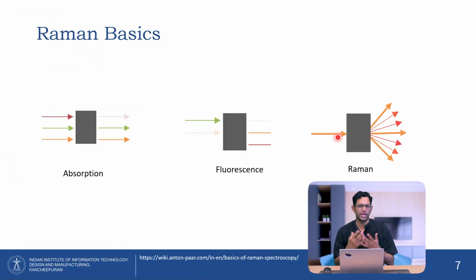This may not be true by visualizing through the naked eye, but with a more sophisticated optical instrument and detectors, you would appreciate that the light coming out of the nail is different compared to the light coming out from the tissue, and that is what we are going to study.